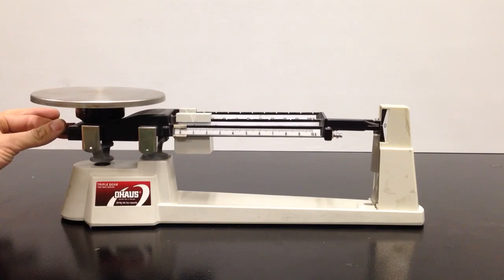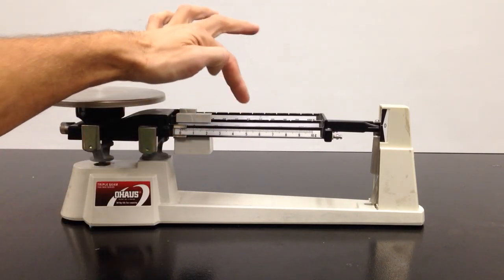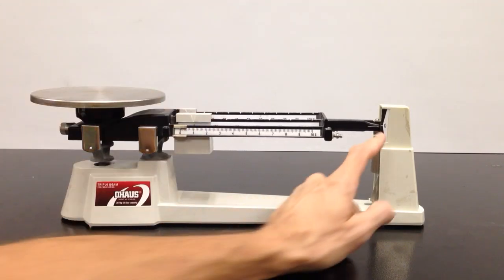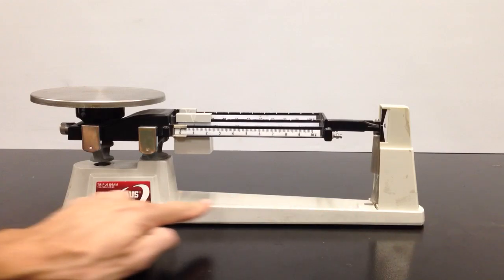Again: tray, adjustment knob, riders, one two three beams, pointer, the zero or scale, and then here's the base.